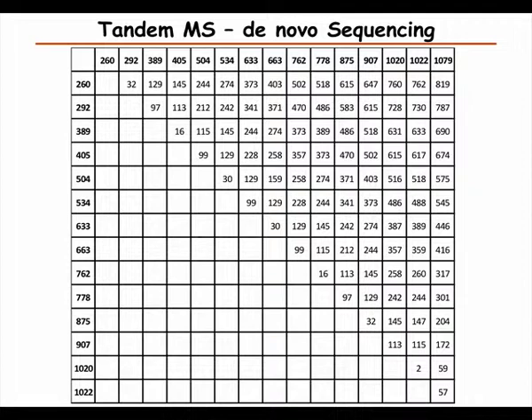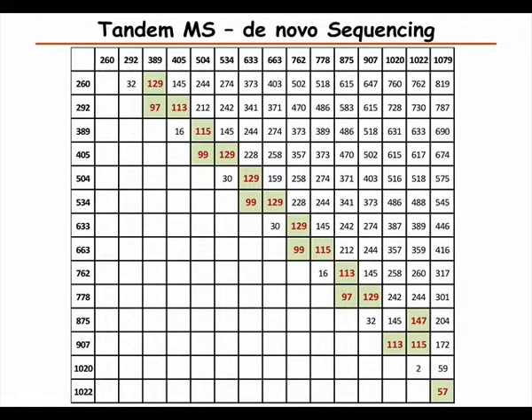And we can then look at the ones. These are the mass differences that correspond to amino acids, which have been marked in green. And then we can switch to the amino acid symbol.